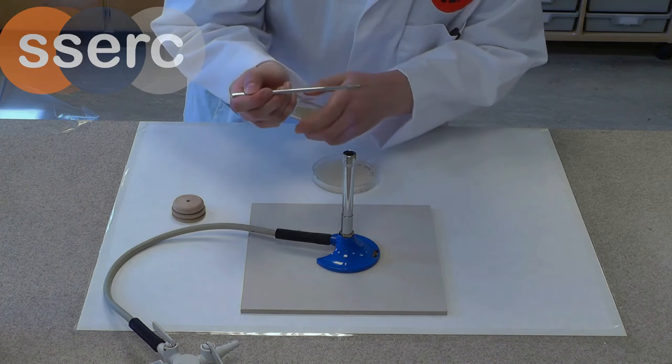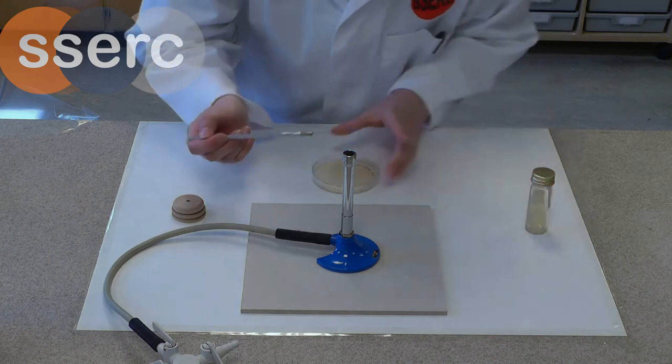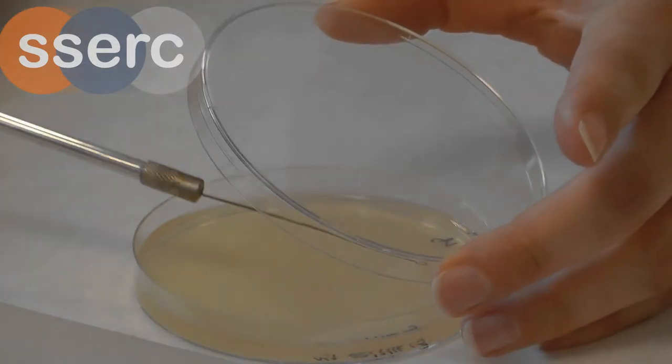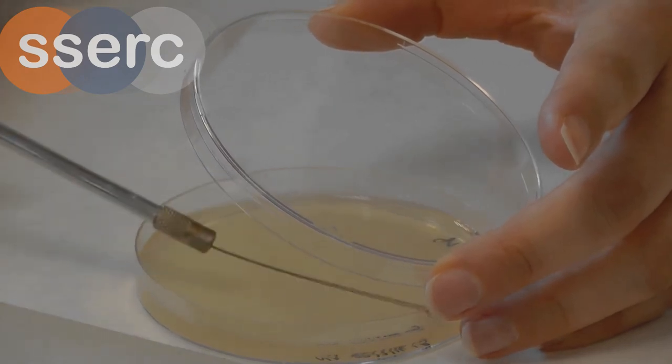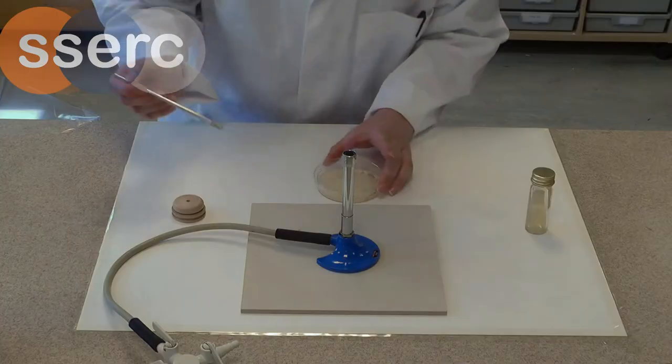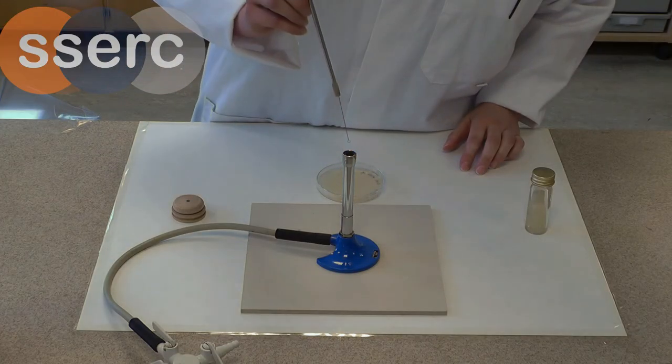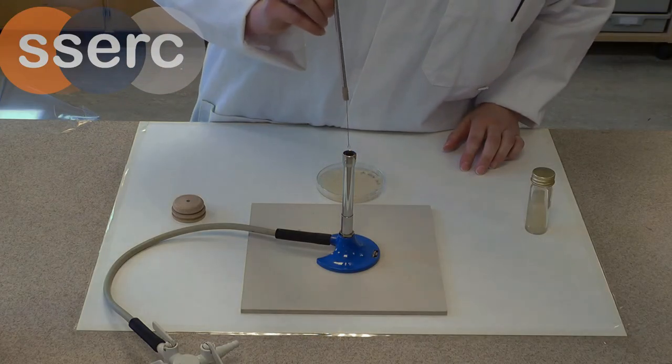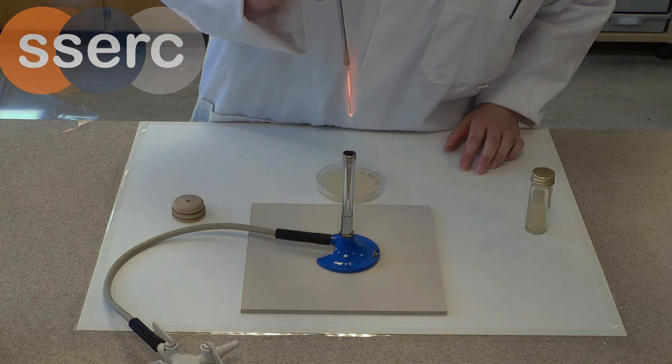Flame the neck of the bottle again before you put the lid on. Lift the lid of the petri dish just enough to get the loop in and make a simple streak across the surface of the agar. Finally, flame the loop again.